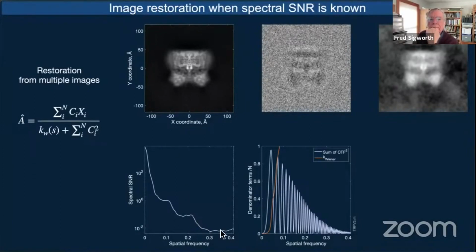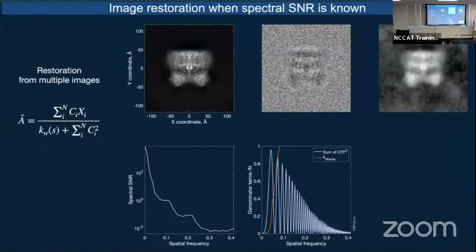Beyond this, the spectral density is pretty much constant, and that's because on shorter length scales, a macromolecule looks like just a bag of randomly positioned atoms, and that would give you constant spectral density. And this extra part down here is kind of the envelope function, the fact that there's the whole object here. Thank you very much.